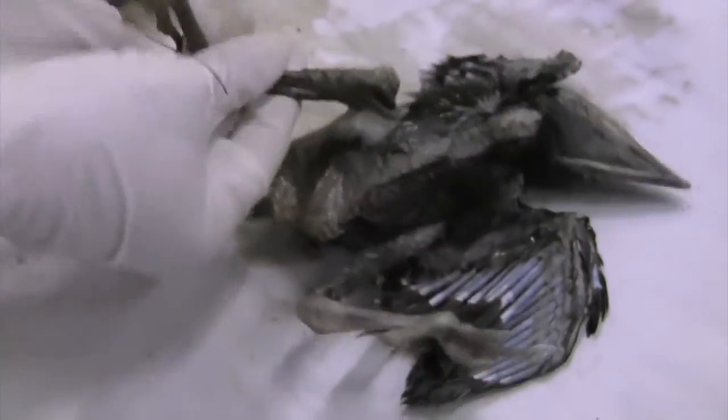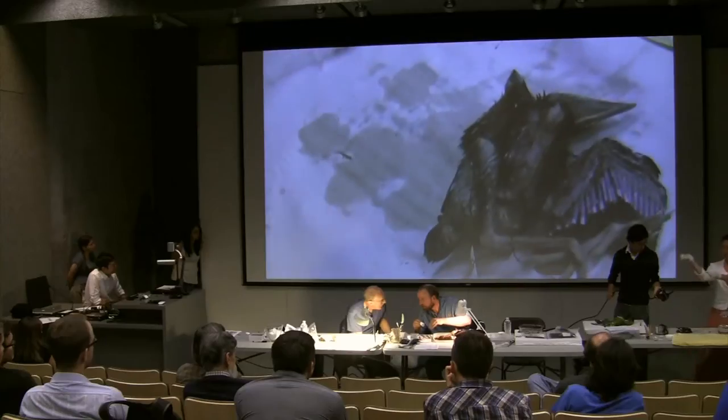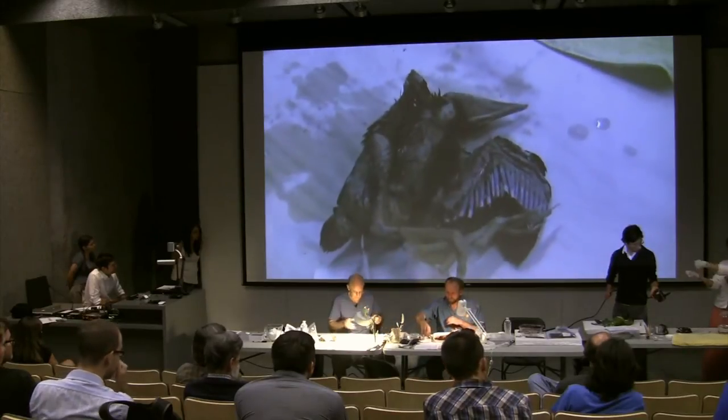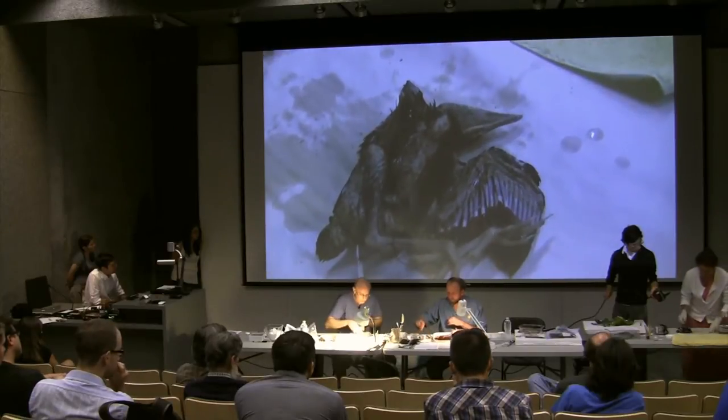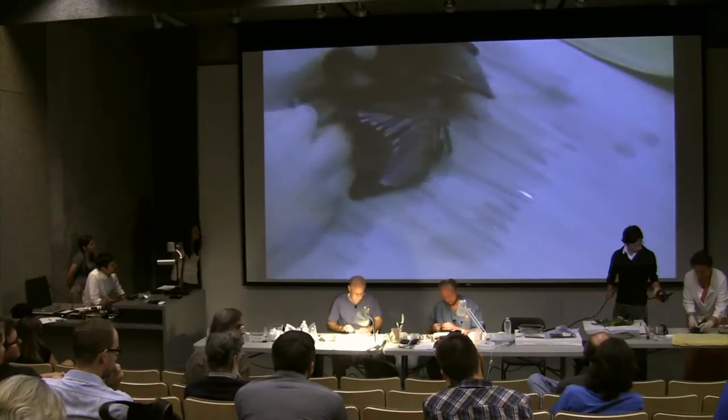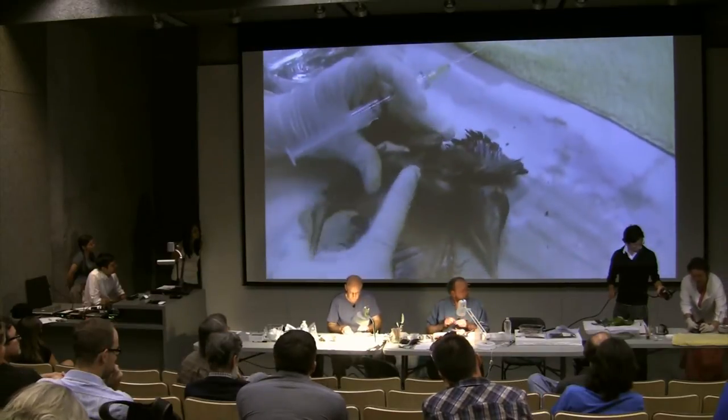There's wing one, wing two. The inside of the wing has a nice bald patch with a lot of muscles, so this is a perfect place on the bird. Likewise, the inside of the upper thigh is a great place that's usually kind of bald, so you can see what's going on.